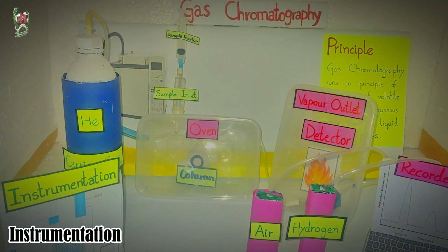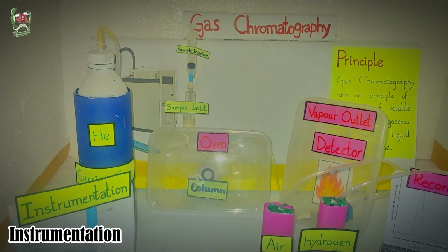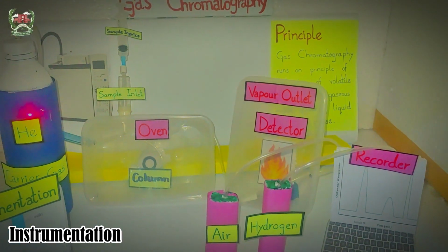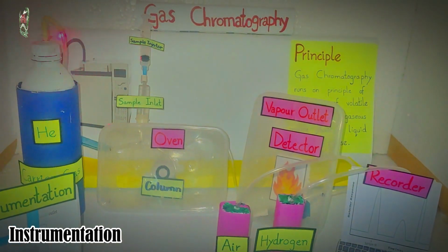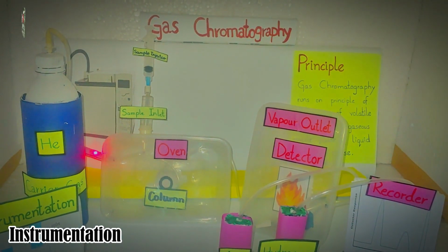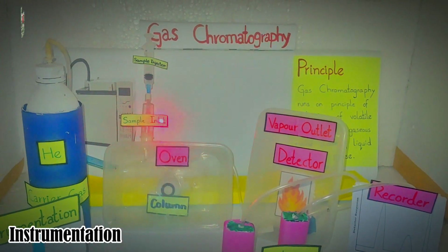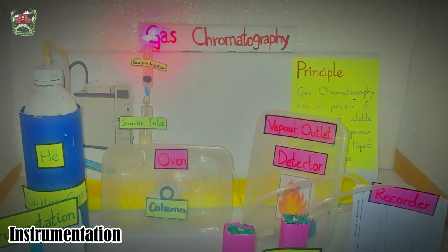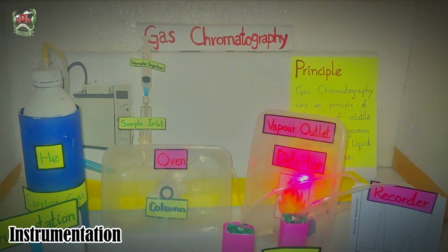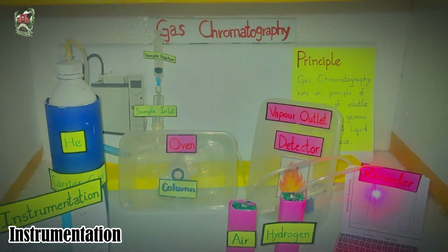And now I'm going to explain about the instrumentation and the working of the gas chromatography or the GC. Gas chromatography instrument is constructed of various parts, which are gas tank, gas tube, gas valve, GC column, GC oven, sample inlet, sample injector, detector, and this one is the recorder.